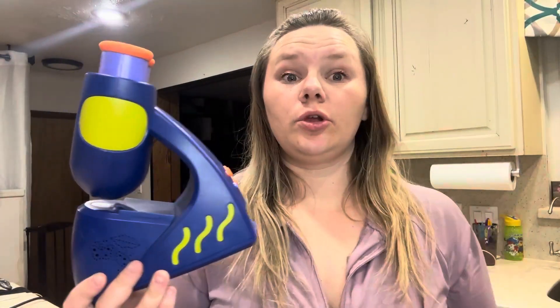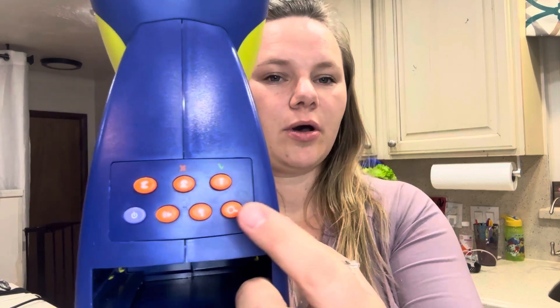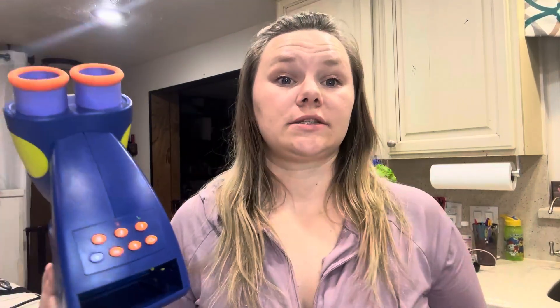When you put it in, it'll start talking to you and it'll be like, 'You picked the bumblebee.' And you can press the search button or the microscope button on the back of it, and it will tell you facts about bumblebees — about their legs, their life, that type of thing.